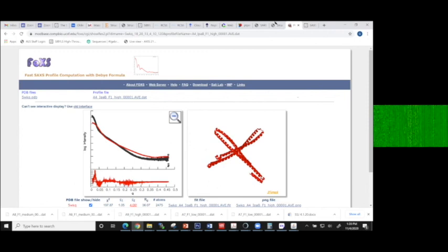All right, with that, Mikhail is chomping at the bit. That protein structure is only a part of the molecule. It's not the entire molecule. Right, so you'd want to build in the other parts and start trying to assemble it.